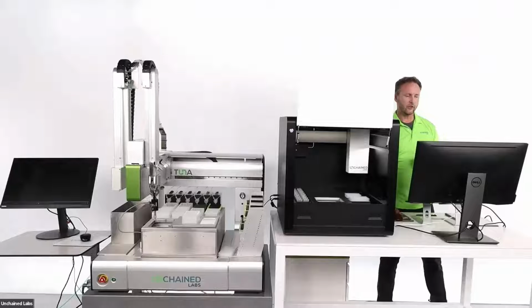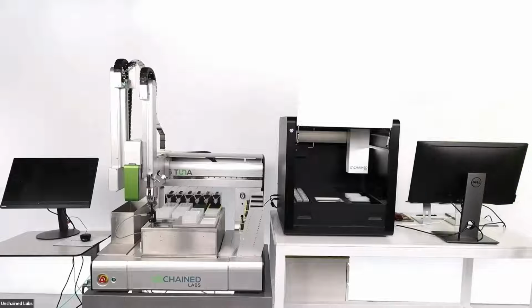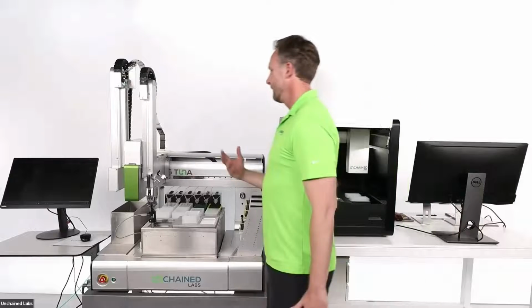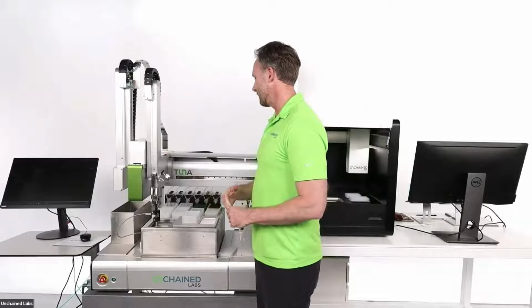So I think I gave you the highlights, hopefully enough for you to see the differences in the software. Now let's go over and see this running in action. Here, Big Tuna. Thank you, Dr. Ross, for the assists getting this started.